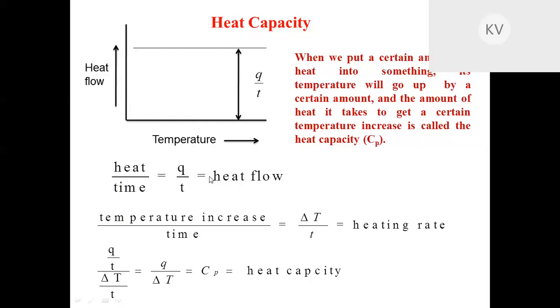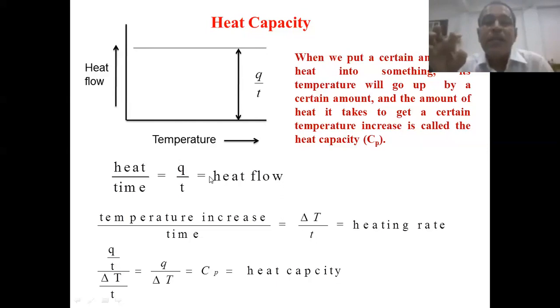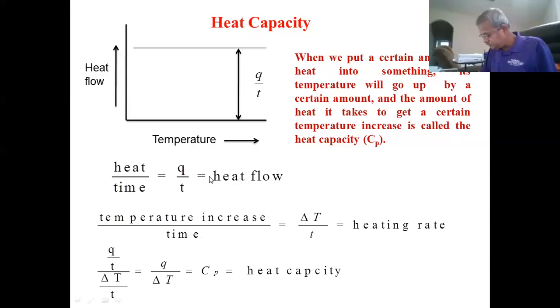So you can determine transition temperature, transition enthalpy, and the specific heat of the material in different phases. You can determine transition entropy also, because transition entropy is nothing but the transition enthalpy divided by the transition temperature. So these are the parameters that you can determine with the help of DSC. And preliminarily, if you have some idea about the transition enthalpy, you can guess what kind of transition is occurring. For example, if you have a melting process from solid phase to liquid phase, then it will have a huge amount of enthalpy. But in the case of a mesophase transition, for example smectic phase to nematic phase, you will have a very small transition enthalpy, maybe one tenth or even smaller than that of the transition from crystal to liquid.